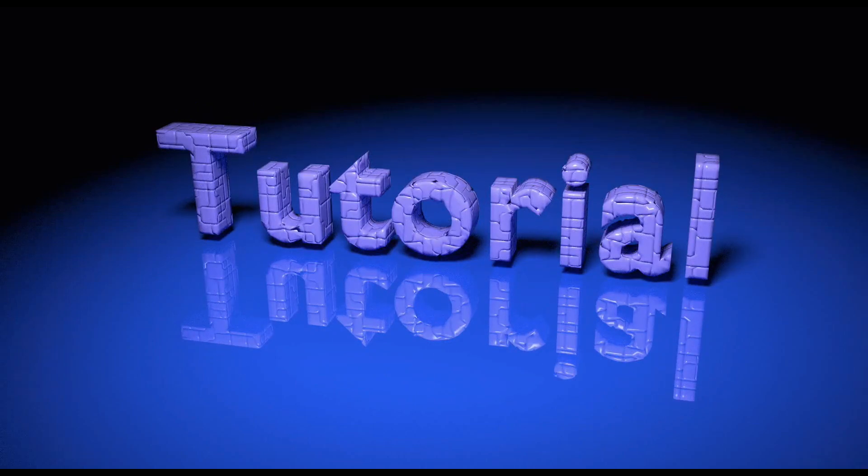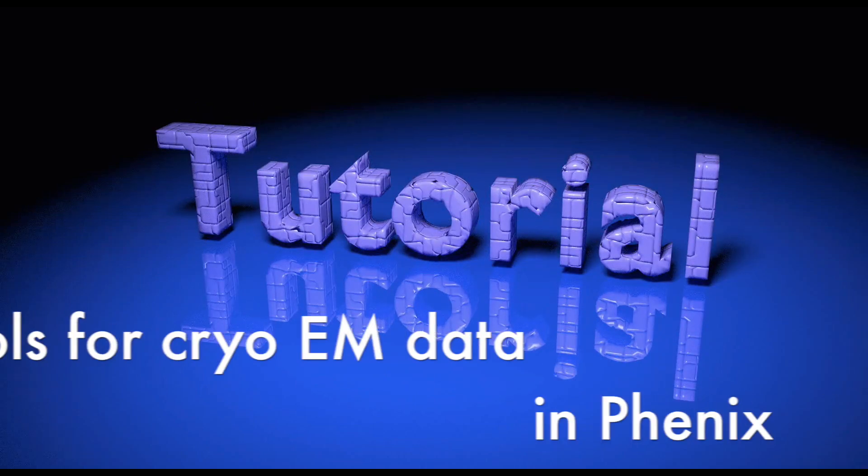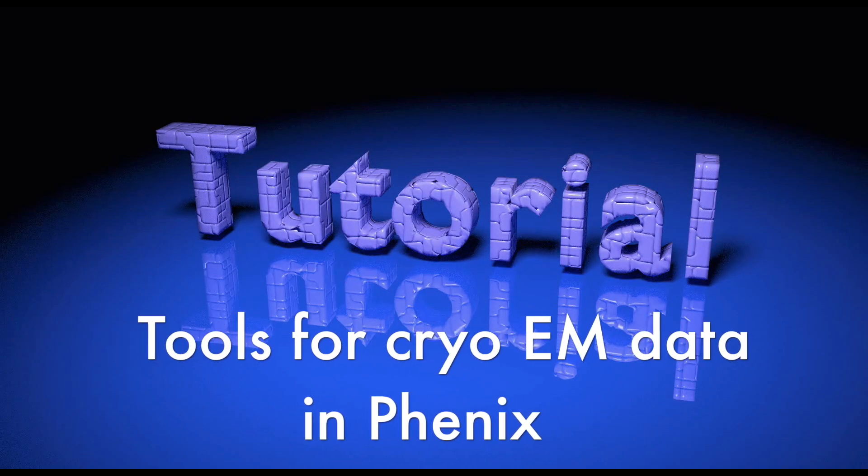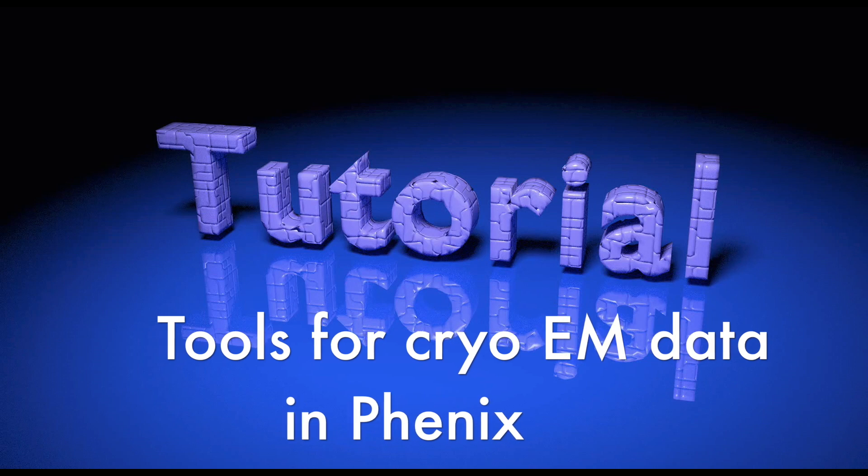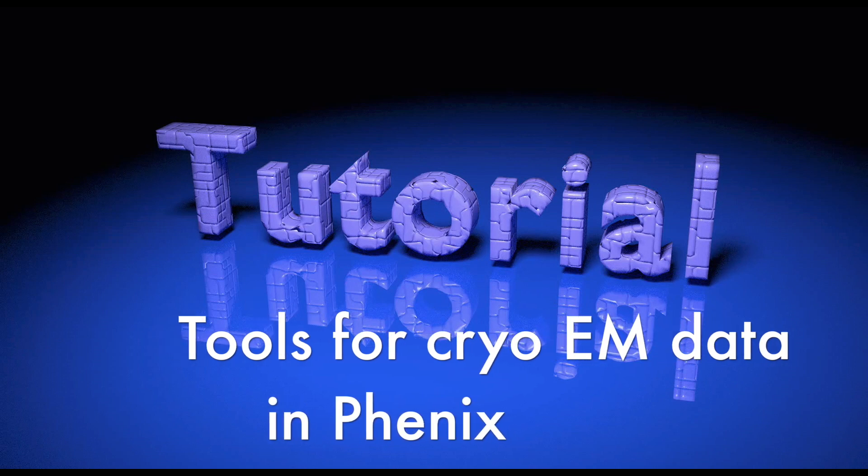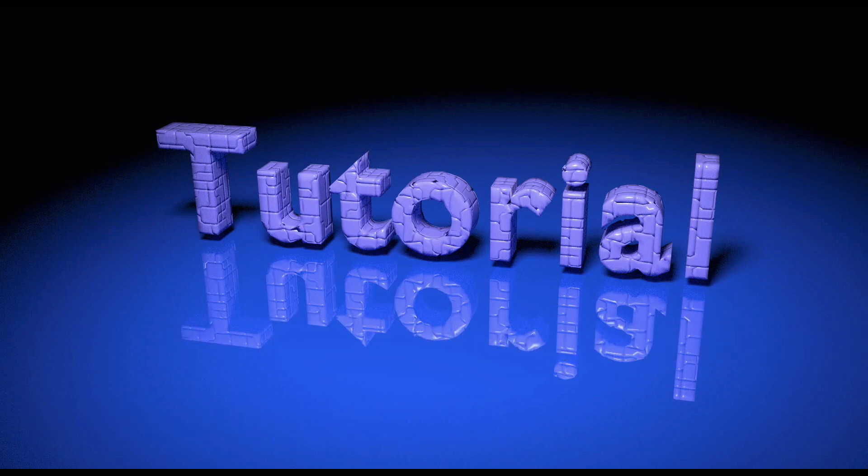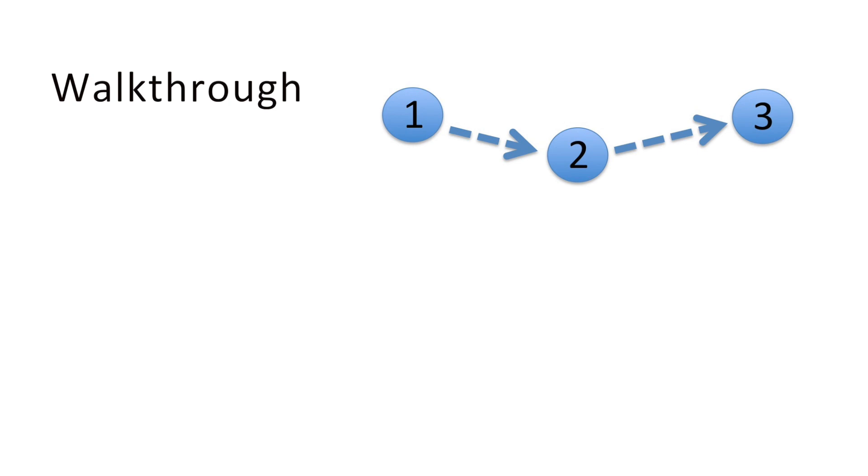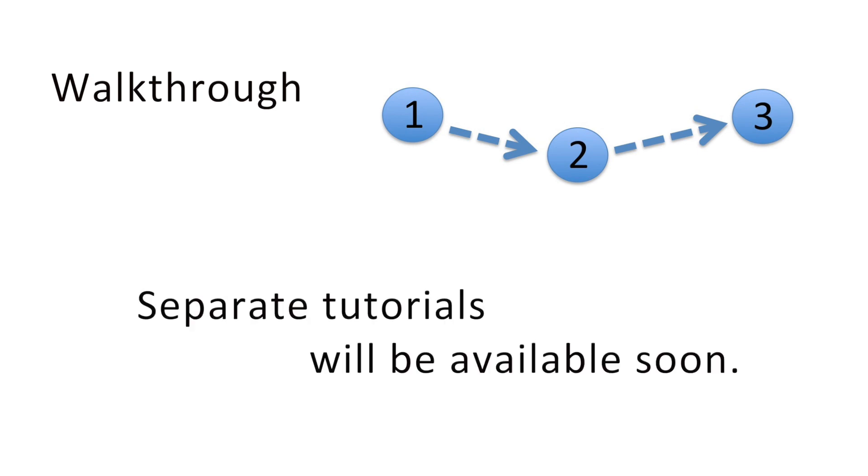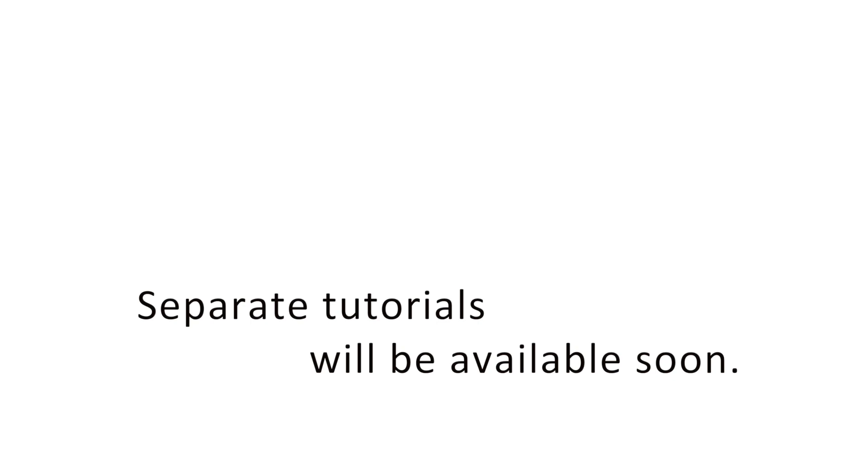Hi everyone! This tutorial gives an overview of the tools which are available for Cryo EM data in Phenix. The video shows a walkthrough and gives a brief overview of the tools. Details of each program will be discussed in separate tutorials.